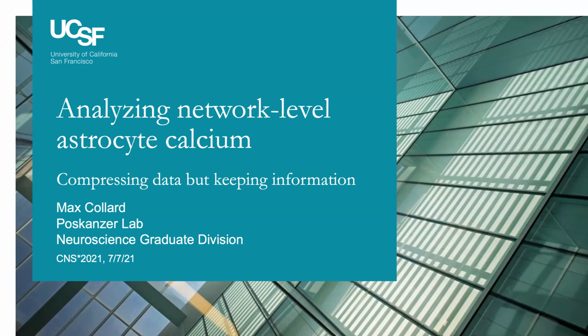And today I'm going to talk about analyzing astrocyte calcium data at the network level. In particular, I'm going to focus on how viewing astrocyte calcium data as discrete calcium events facilitates analysis by enabling the compression of data while still maintaining important information about the dynamics of astrocyte behavior.